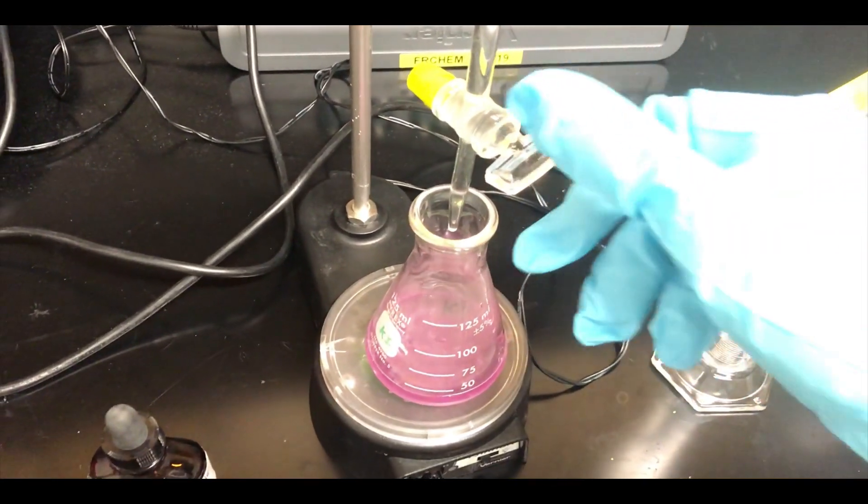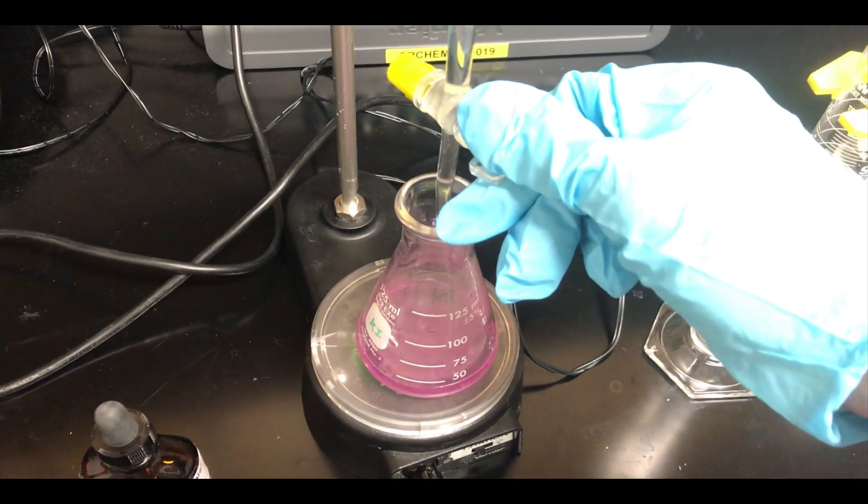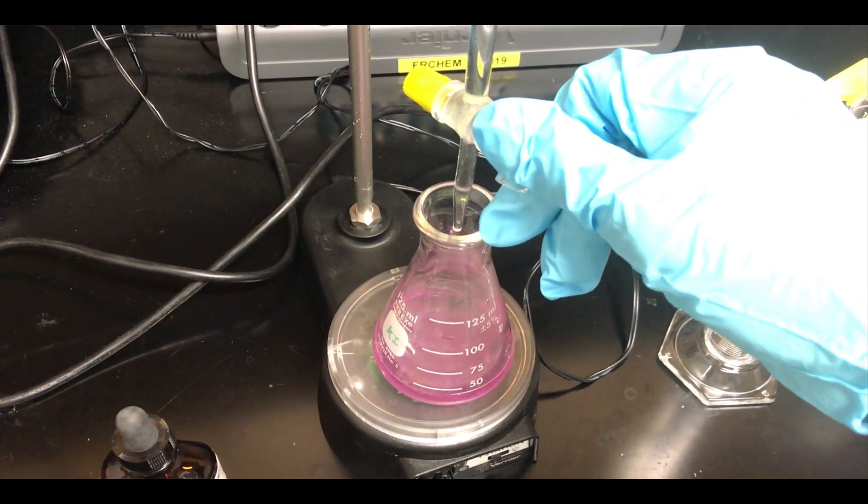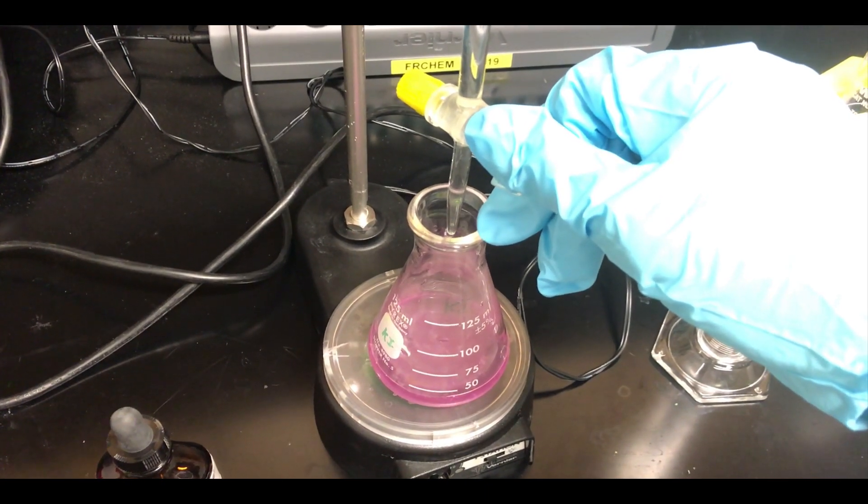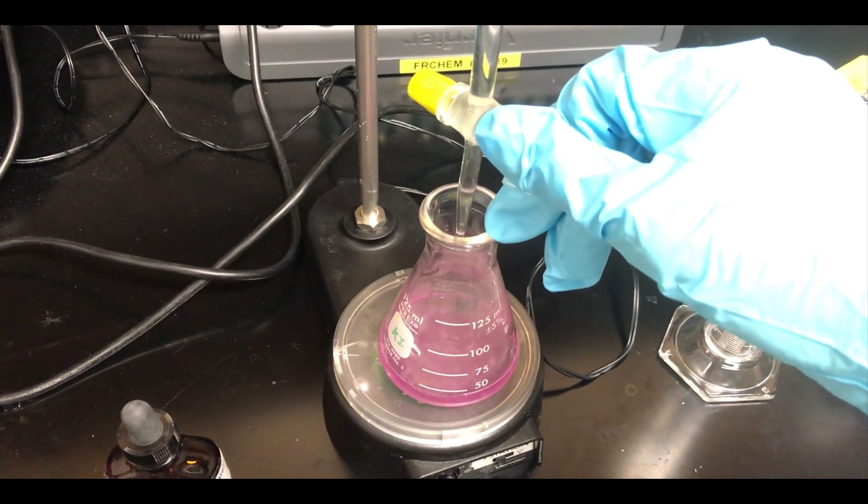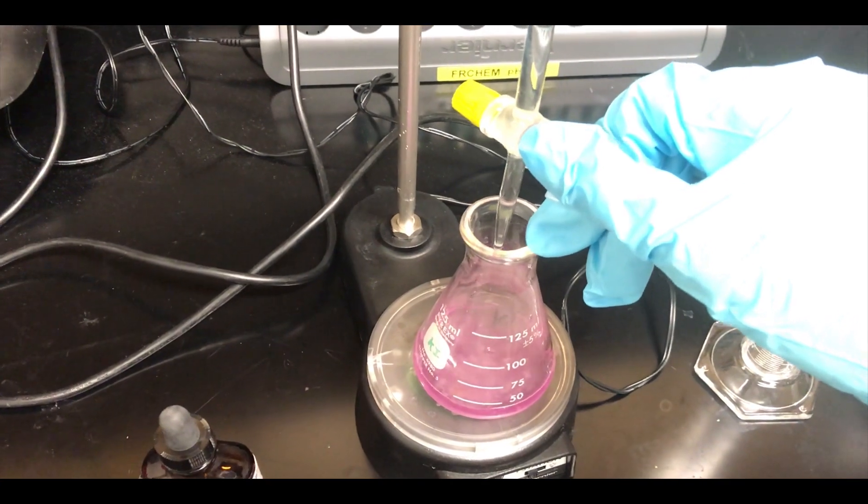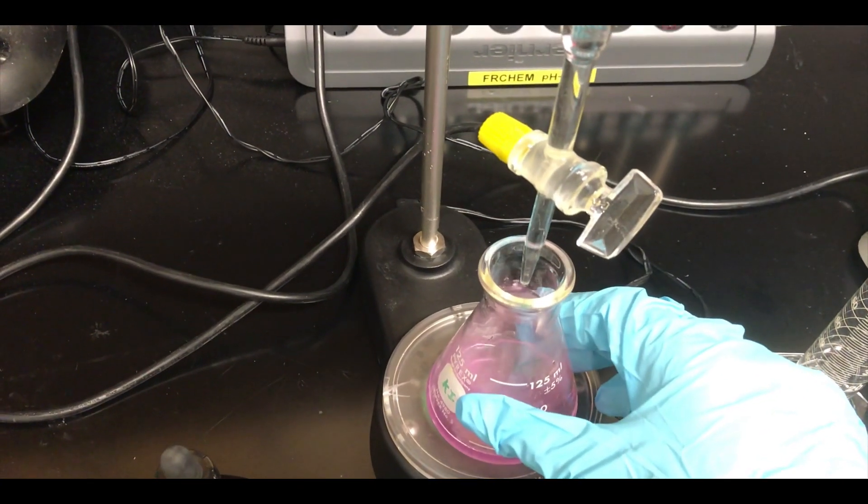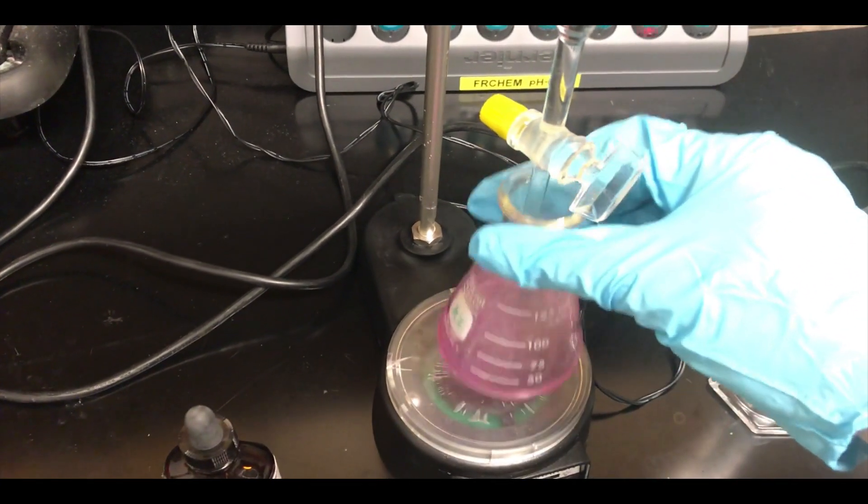And now we will open that stopcock and start dispensing dropwise our solution of hydrochloric acid. And we're going to continue to do this until that solution goes from the deep pink that you see right here to a light pink color with swirling of the Erlenmeyer flask. Or if you have a small stir bar you want to add and use the stirring capabilities of the burette stand, you absolutely can as well.